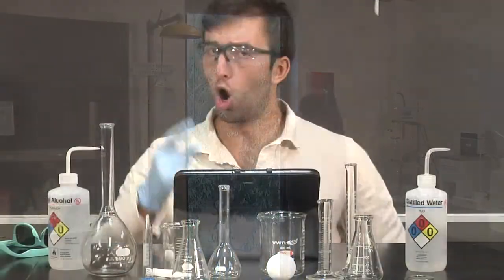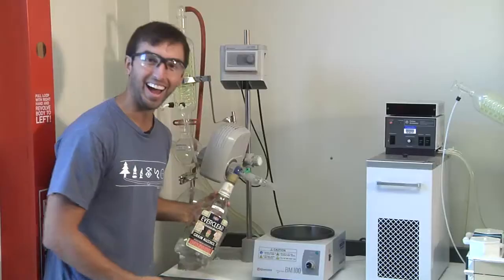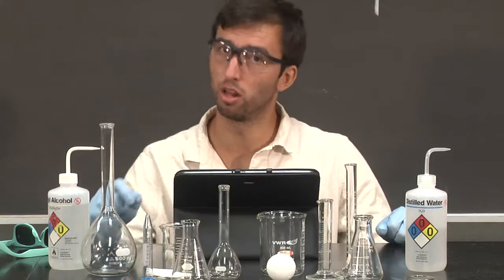Only authorized experiments are allowed in the lab. No one is allowed in the lab without an instructor. No children or animals are allowed in the lab. MSDS sheets tell you everything you need to know about a specific chemical.